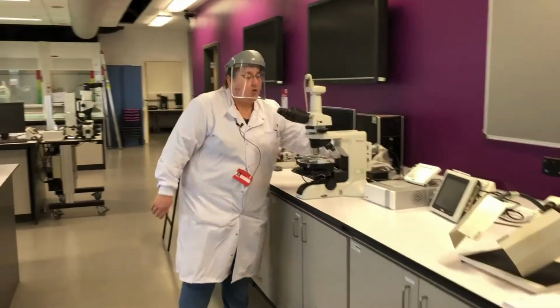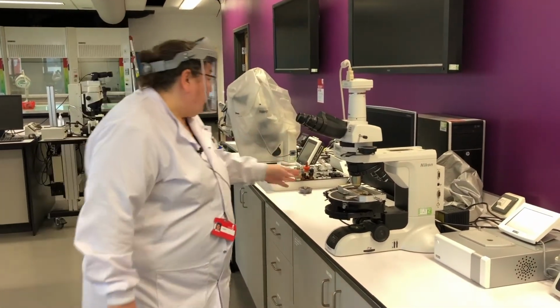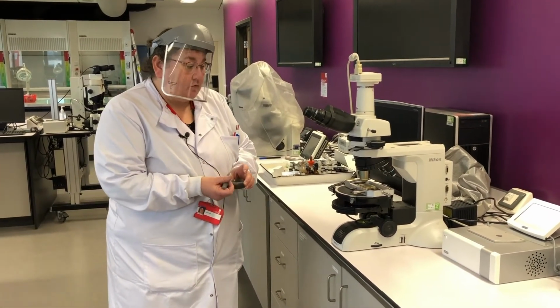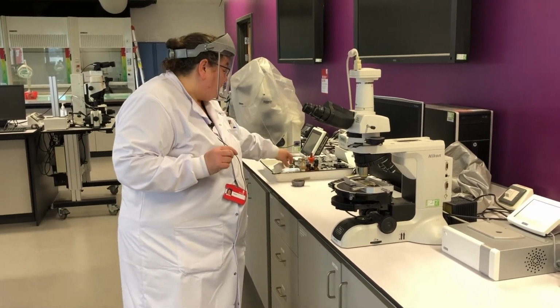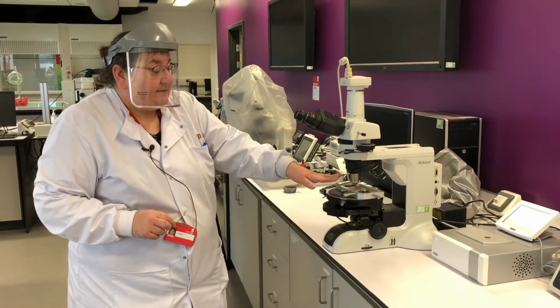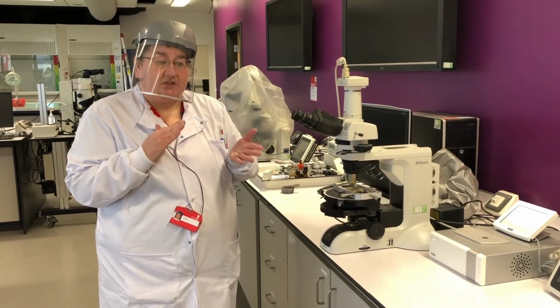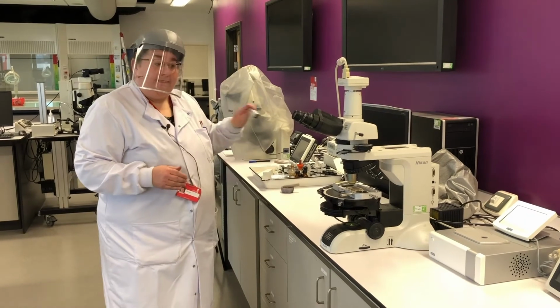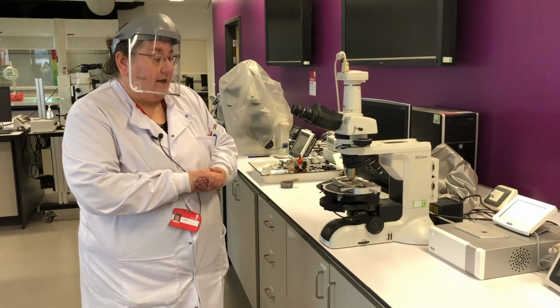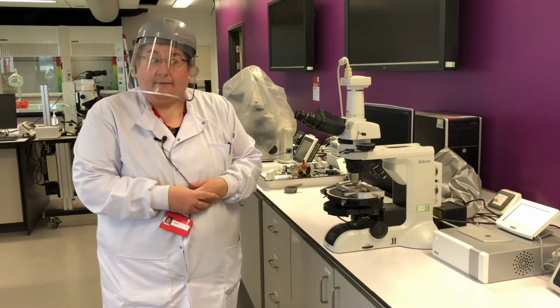Here we have our Nikon microscope that the students do their glass analysis on. With a suspect sample of glass, they would grind it up in the pestle and mortar. They would then put a small amount of the refractive oil onto the slide and add the glass. It's then put onto the plate and heated up, and as soon as you cannot see the glass, it matches the refractive index of that oil, and that means you have the refractive index of the glass. So that's another good piece of evidence that the students usually use if they found a suspect bottle at a crime scene as well.